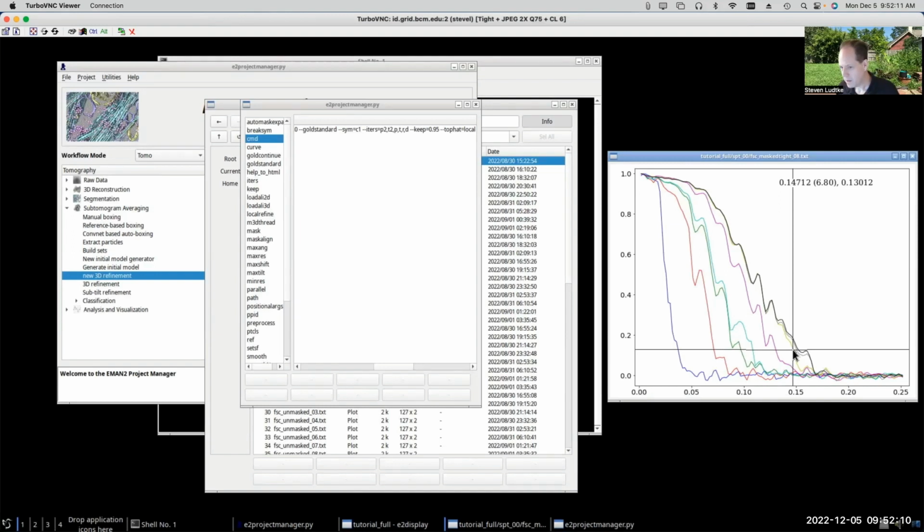And then the rotational alignment got us a little bit more, so 6.8 to 6.6, and then the defocus adjustment got us maybe a tiny bit more, but not really very much. So the rotation did actually do a little bit here, but not a tremendous amount. Obviously, the difference between here and here is substantial. The difference between here and here is substantial. This difference, not so much. And this difference, well, I guess if you really push things, you might be able to make something out of that, but that's not really real.